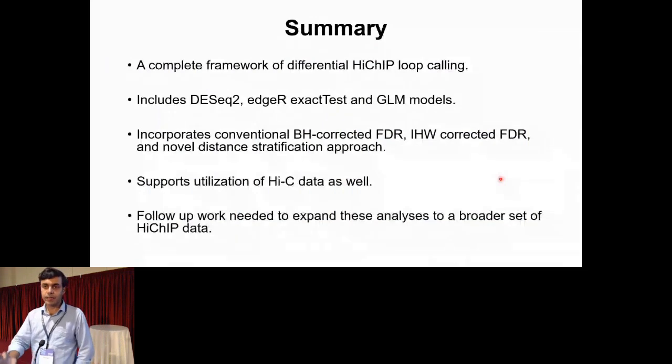And this is the summary: DeFiChIP, a comprehensive framework encapsulating every possible model, supports HiC data as well in addition to HiChIP data.